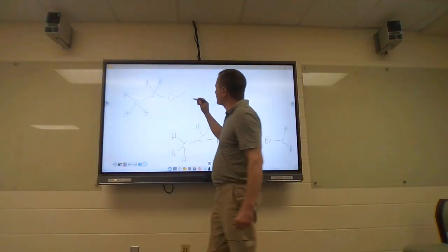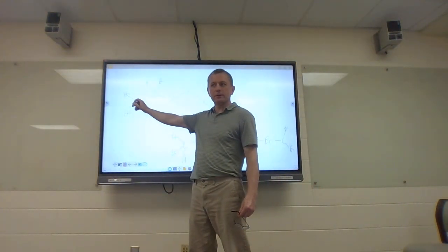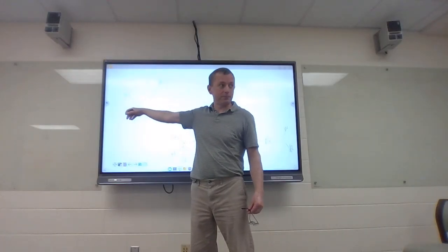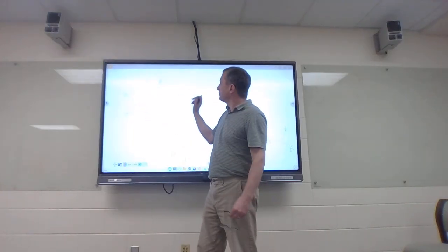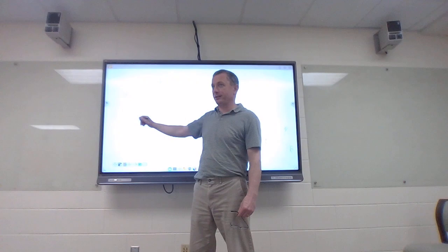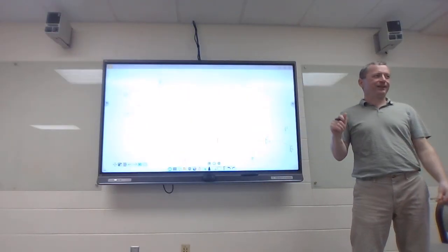So what happens here is, well, there, I add more carbons. What would happen if I added the carbons out here? They would be even farther away. I would lose 3 here, and the splitting would be different. So that would change the splitting, and it would change the integration. And yes, you're right. Now, if I add more carbons out here, they'd all end up landing around 1. This is when you see a lot of peaks landing in the same area, when you have a long extended chain. I did not pick octanol for any of you to analyze by NMR.